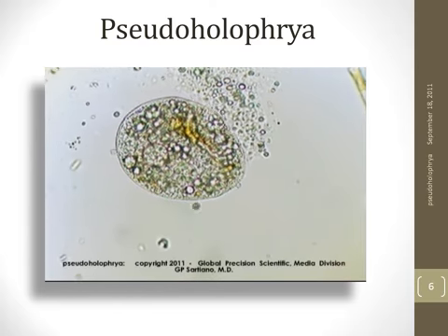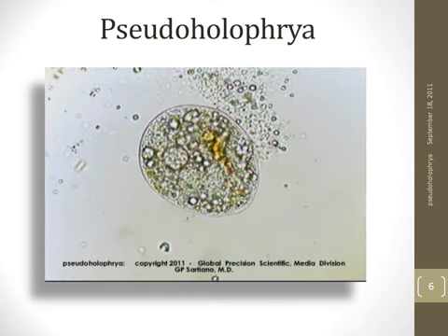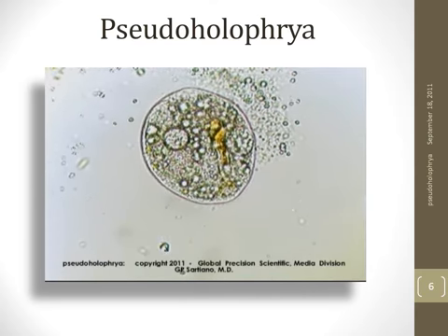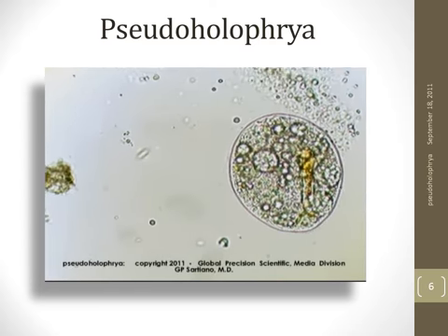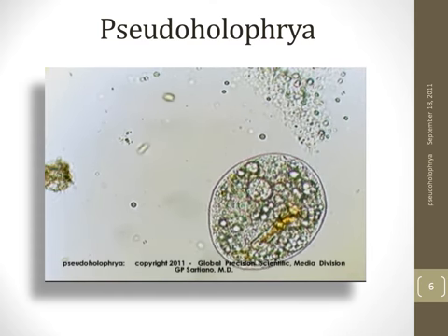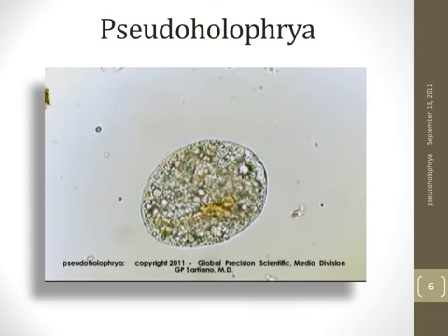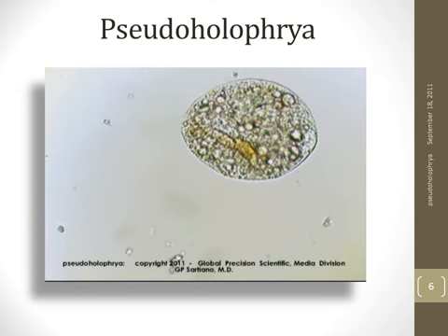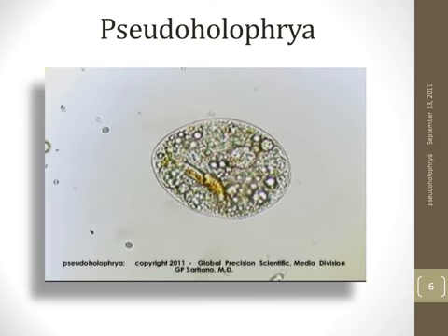Note that the coordinated motions of the perioral cilia set up bilateral vortices which run clockwise and counterclockwise and bring particles to the cytostomal entrance.